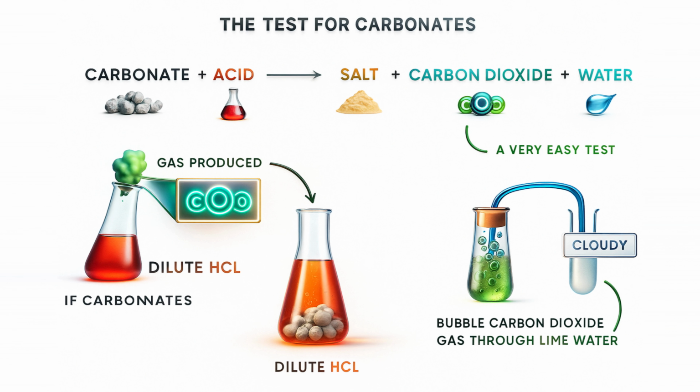If the gas released during the reaction is carbon dioxide, it will turn lime water, which is a clear solution of calcium hydroxide, cloudy. This cloudiness is caused by the formation of solid calcium carbonate particles that scatter light, making the solution appear milky.